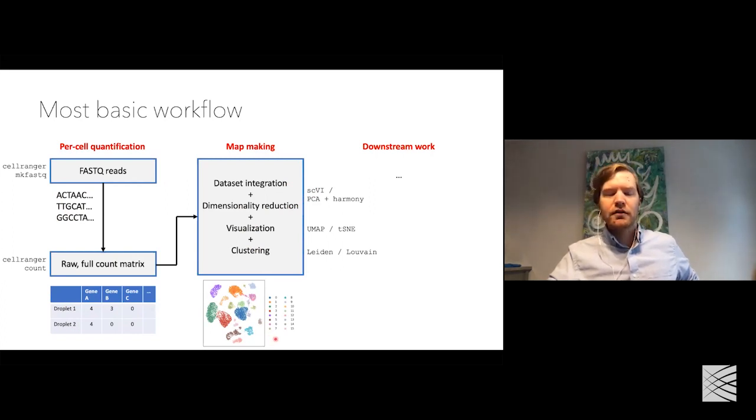And you can summarize the experiment with these neat two-dimensional representations of this complicated data set. What you can see happening here is every dot represents an individual cell from the experiment. And you can see that they sort of form these little groupings or clusters. And the idea in this picture is that similar cells are close together on this visual representation. And so what's happening here is the different colored blobs are actually different cell types in the experiment.